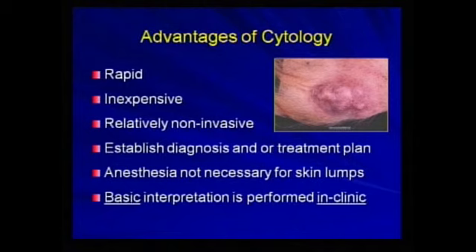The pain associated with aspiration is simply the needle passing through the overlying skin, if there is such. Most tumors are not innervated, at least in terms of pain, so most animals do not resist this procedure much at all. And finally, the basic interpretation is performed in the clinic. I believe that a skilled clinician can make many of the diagnoses we're going to talk about today.